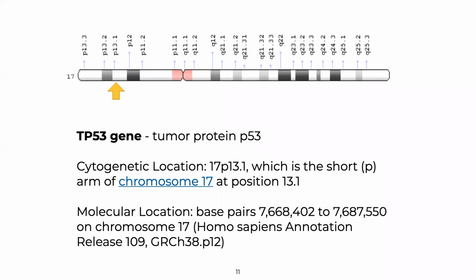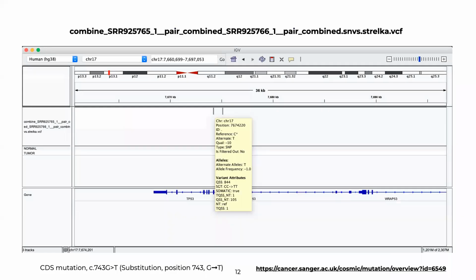And so to look at the specific mutations within the TP53 gene in those cancer cell lines, we looked at a number of different positions using integrated genome browser. And typically what you would want to do is produce a somatic mutation analysis, so analysis called variant calling.